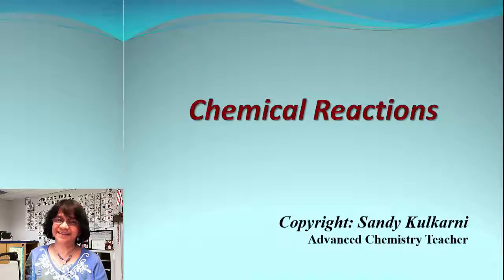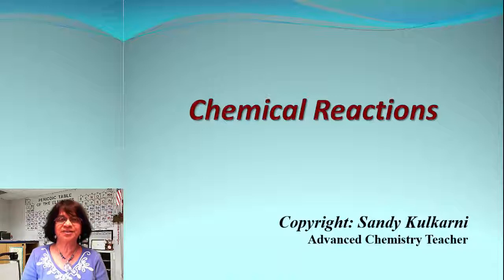Kids, Miss Kulkarni here. In this video, we will talk about chemical reactions and how you know chemical reactions really take place. So what is the evidence you're going to see in chemical reactions? Let's see each of the reactions one by one.